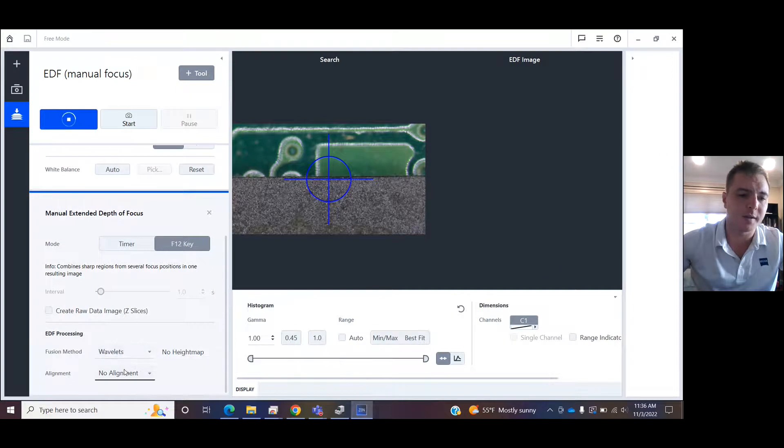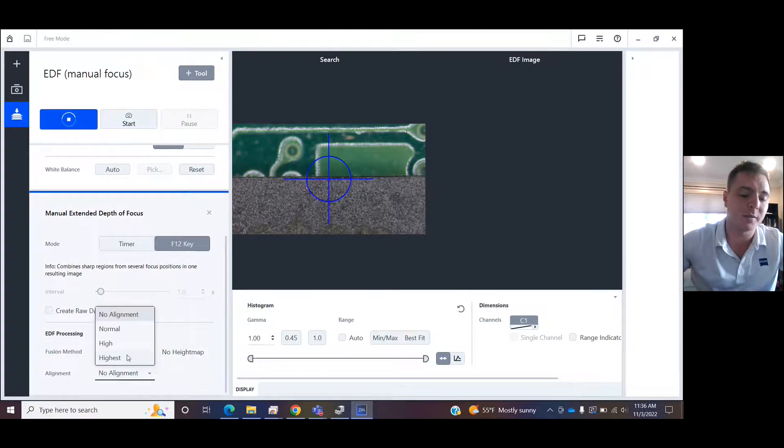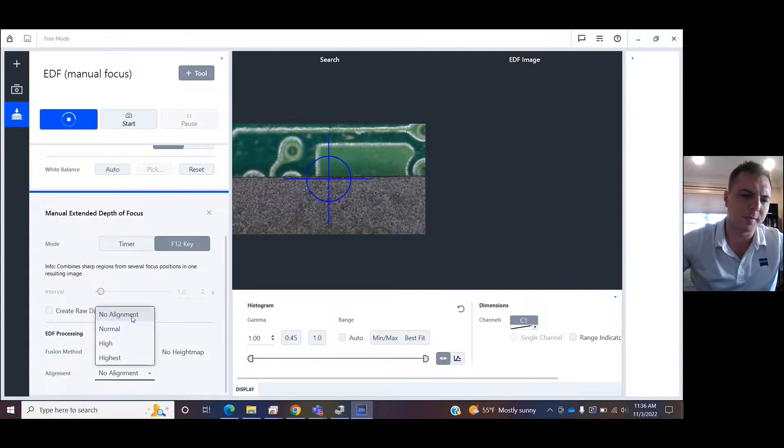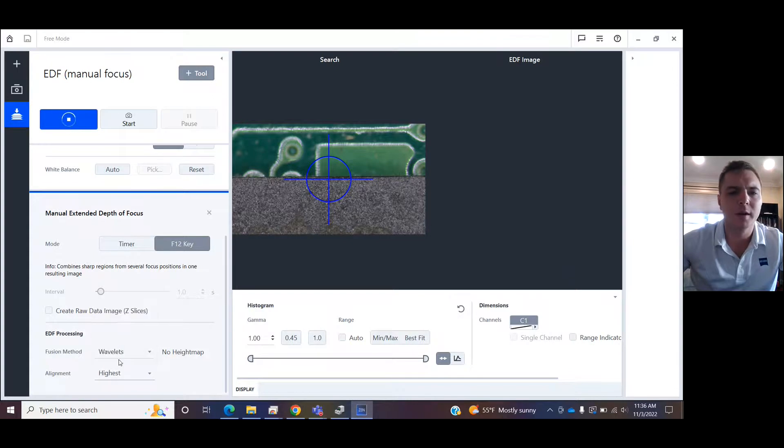Or a compound microscope, you might be able to go with No Alignment or Normal. This is just going to stack everything the right way. So I'm going to press Start, and now we're recording. I'm going to press F12.